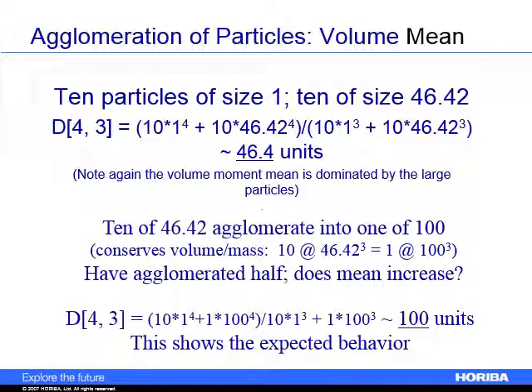Treating particle size like it is just a number, or just a value that the machine outputs, without thinking about all this other stuff we've talked about, is how people run into problems in understanding the behavior of their system: clogging a filter, buying the wrong filter, too many filters. That's just an example. Over-milling your material with time, under-milling your material, misunderstanding the breakdown that's happening during milling. Particle size measurement can allow you to understand all of these processes that occur and better control your systems and your behavior. This has a big impact on material science, so it's something very important to understand.